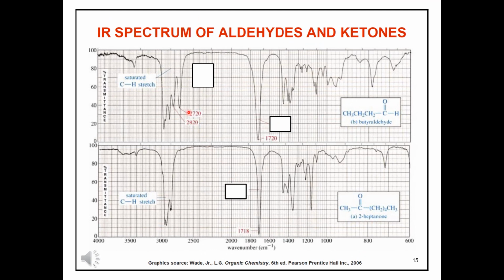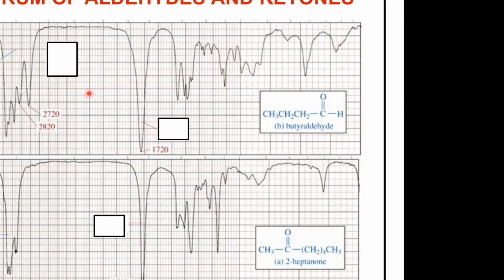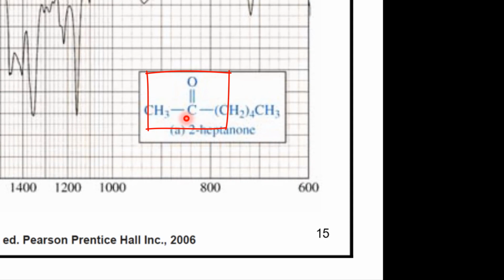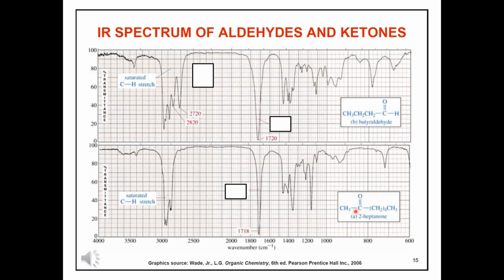We're now going to survey some carbonyl containing compounds. So these are ones that include the carbon-oxygen double bond. In an aldehyde, the carbonyl bond is found at the end of a carbon chain, whereas in a ketone it's found somewhere in the middle, or certainly not at the end. As a result, the carbon of the carbonyl bond in an aldehyde is also bonded to another carbon and a hydrogen, whereas the same carbon in the ketone would be bonded to 2 other carbons.